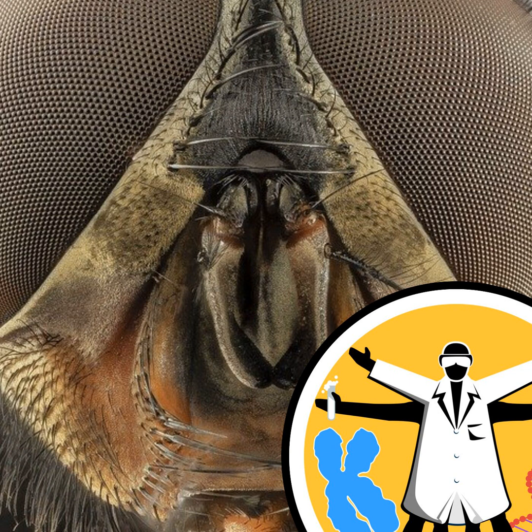Okay, you said the first option was to mash up the flies. Yeah. The second option is just to dunk the flies in a special chemical that is normally part of the DNA extraction procedure, and we're just going to leave them there and dissolve basically everything on the outside of them, and hopefully not too much fly. So I'm not sure how that's going to work out.